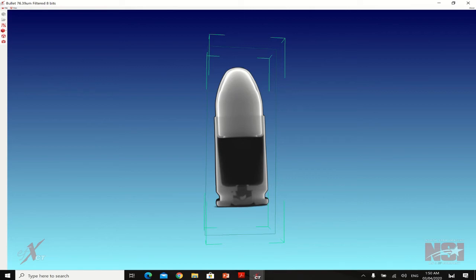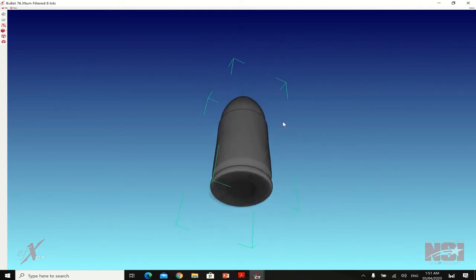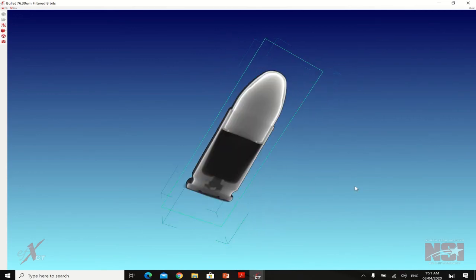Okay. So when you cross section the volume, the keys needed to be pressed are the numbers 1 to 6. So each number represents a plane. Every time that you are given this file, the default cross section will be number 1. So we press the key number 1, and then your sample becomes uncut. Okay, now you can press the key 1, and then you view your first plane.